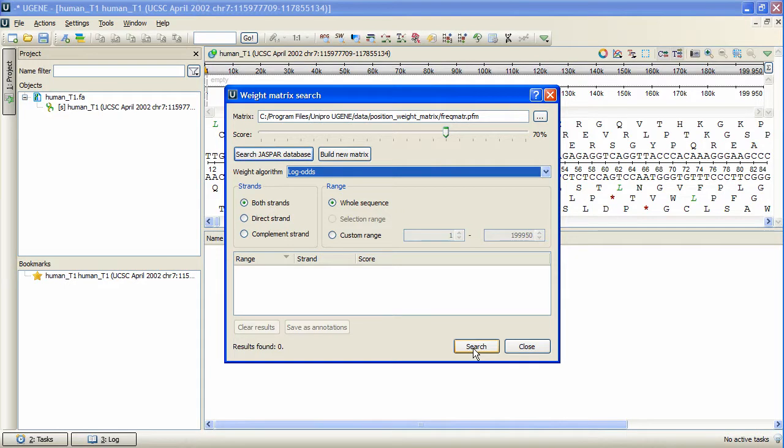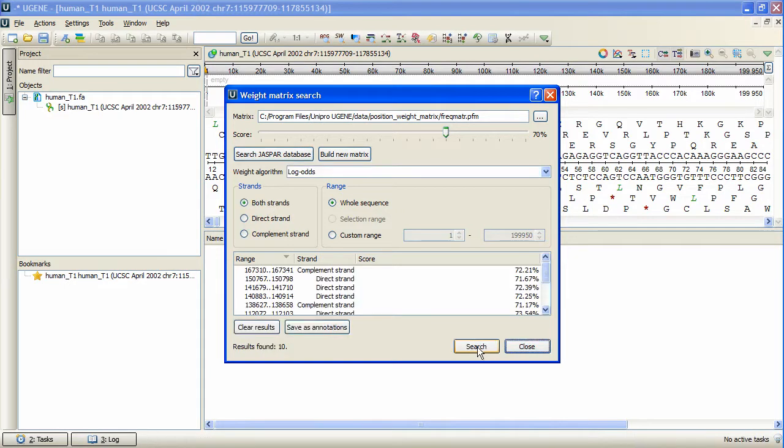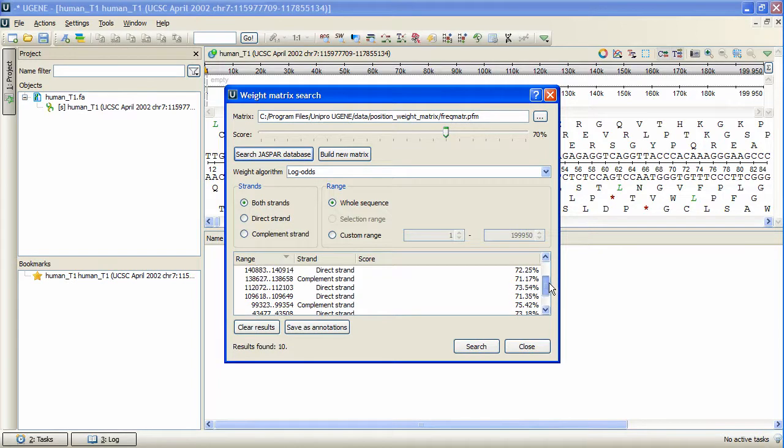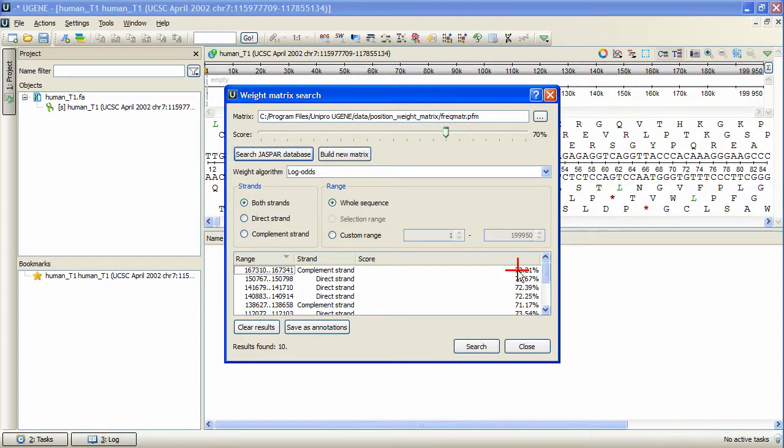Press Search. The task is finished, and all the search results are represented in the table below, including the identity scores.